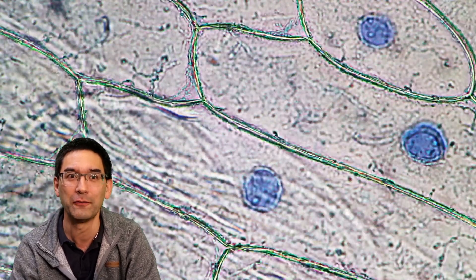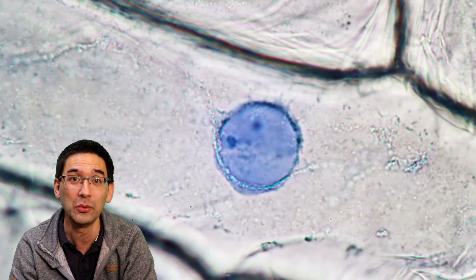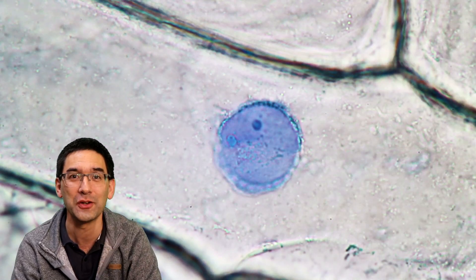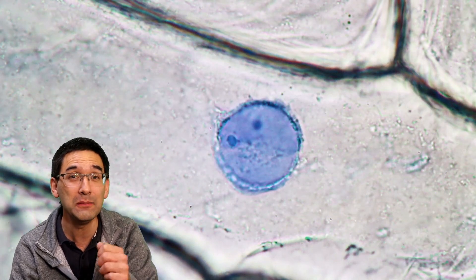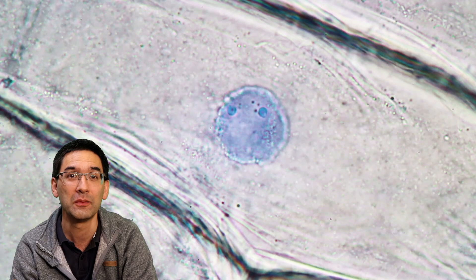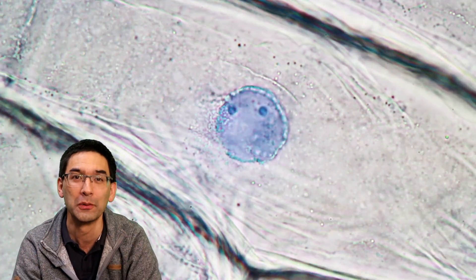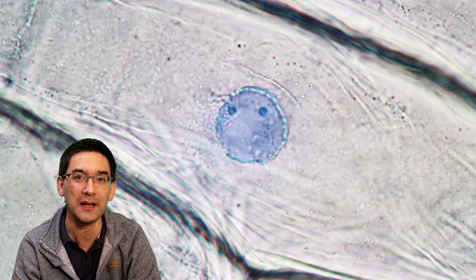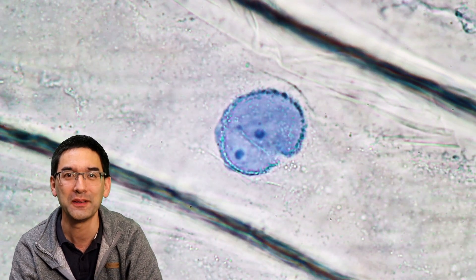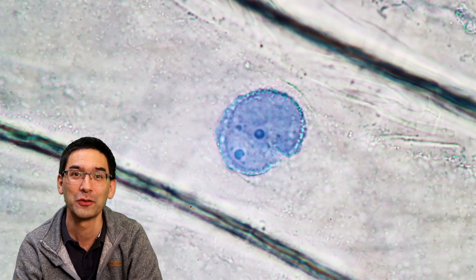Let's zoom in a little bit further. The cell wall is always quite well visible, and in there is always the nucleus. Now look very carefully — do you see those two dots when I'm focusing back and forth? Those two dots inside the nucleus are the nucleoli. The ink itself seems to associate with the chemicals in there, and I think the ink is also able to stain DNA a little bit because it has certain ring-shaped aromatic structures which are quite suitable for staining DNA. I checked several of these cells and all of them had those two small nucleoli. I was quite happy that the results were that definite and clear, even at the first trial.